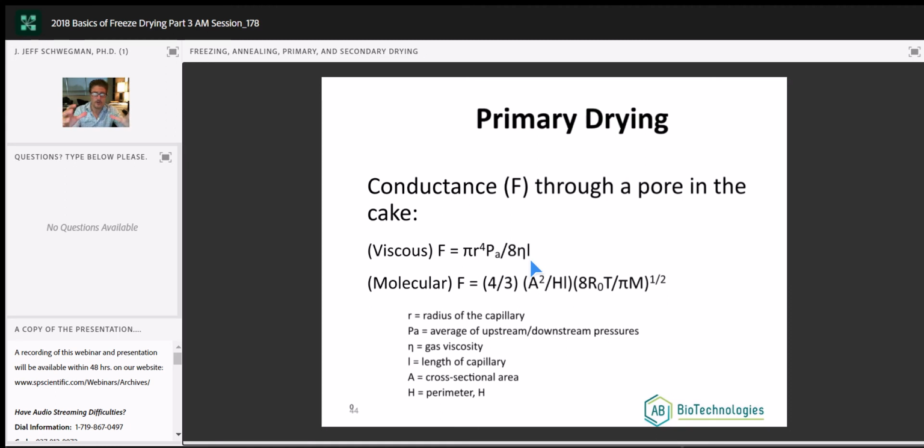If you've got an external condenser unit, so a sample chamber and a separate condenser chamber connected by a tube, they're making those tubes very wide. Okay. They're also making them very short. Okay, to maximize the vapor flow through the throat of the dryer. Again, particle size in our freeze-dried cake, what we can control. The larger the particle size, the much easier it is going to get the water vapor out.